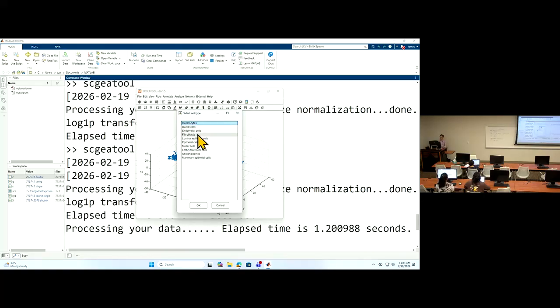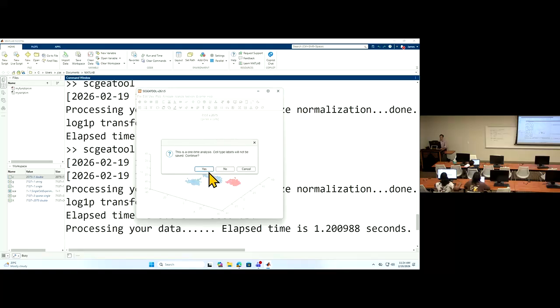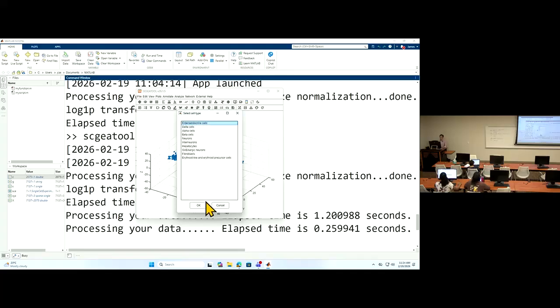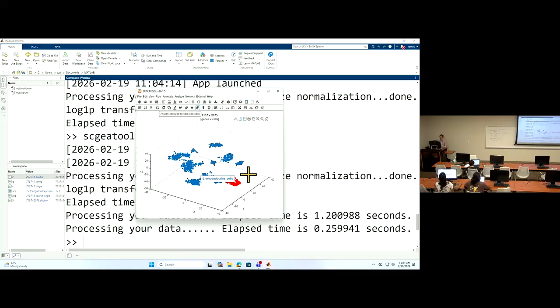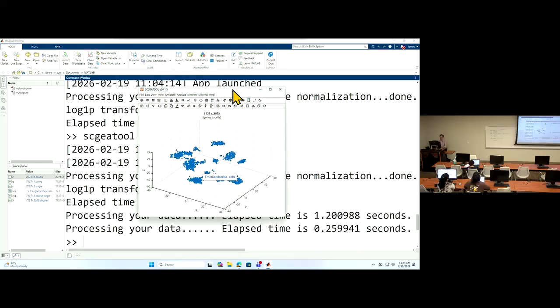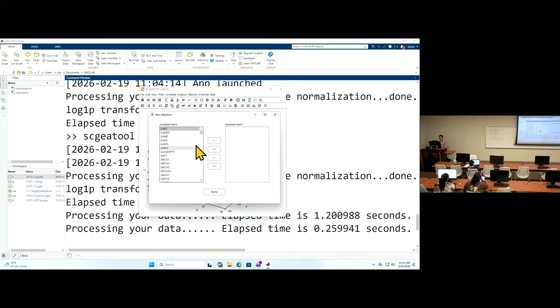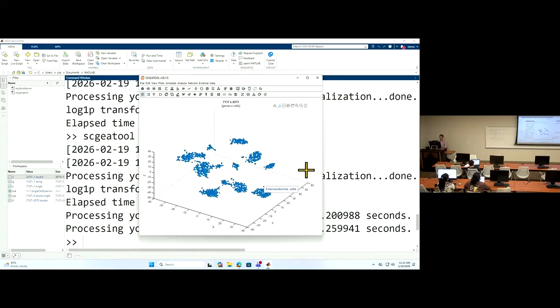And you should have a very quick options. Say, okay, the top one, how about this? So this function can give you a quick understanding of what general cell type you should have in your sample. Let me see, is it human or mouse? This is human data, so I selected the wrong species in my annotation.